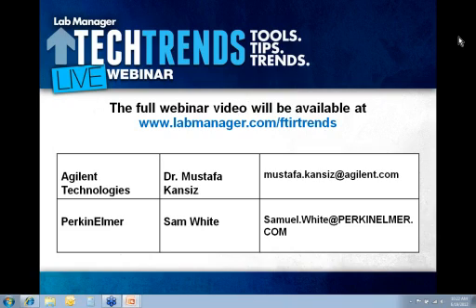Raman is another technique that gives you information that's similar to mid-infrared. It's complementary. And about 80% of the time, you can get the same information by either technique. Raman doesn't require any sample preparation at all other than focusing onto the sample. So that's in its favor.